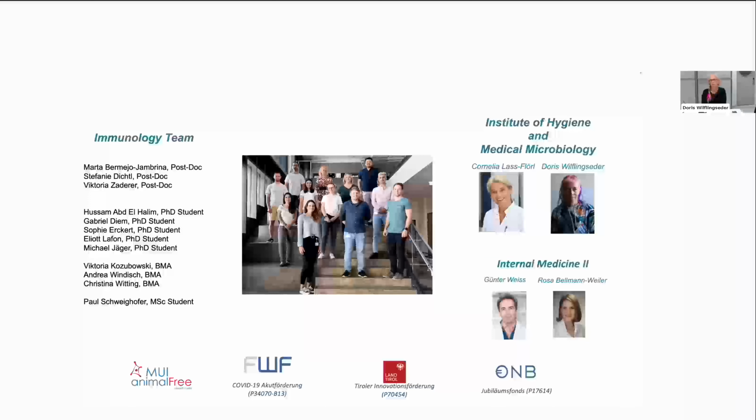The first question, Doris, is, can you tell us the specific protocol for how to generate apical-out organoids using the Clinostar? The exact protocol, I have to check.